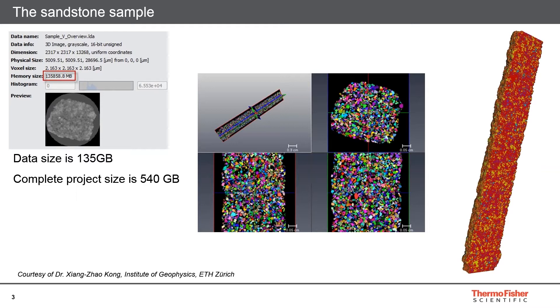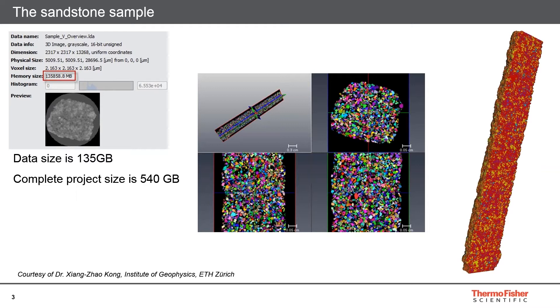The data size is 135 gigabytes and we aim to separate the grains for a further analysis and characterization. If you look at the data size of 135 gigabytes, this is the data size of the grayscale, which is 16 bits. But then, if you imagine that we are going to filter the data with a denoising filter and segment the grains and then separate the grains, it ends up with a complete project size of 540 gigabytes, which is quite big.